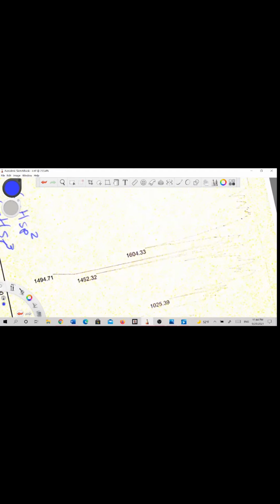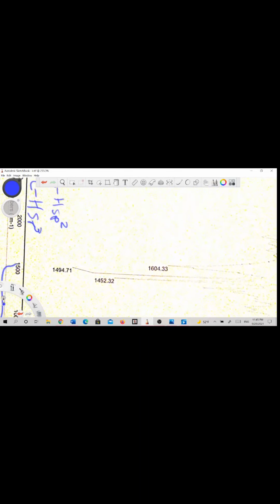We can ignore most of this 1500 to 500 range because that is the fingerprint range. But there is one more peak I do want to mention, which is the one at 1,600. What this tells us is that this is a double-bonded carbon to carbon aromatic, which will help us figure out which of these compounds this graph could potentially be.